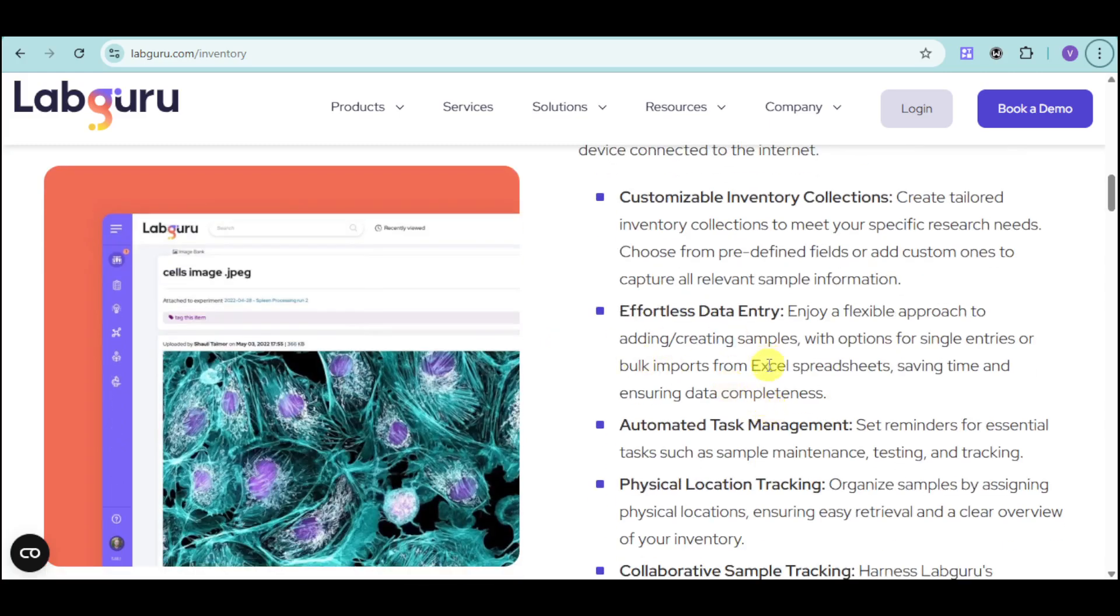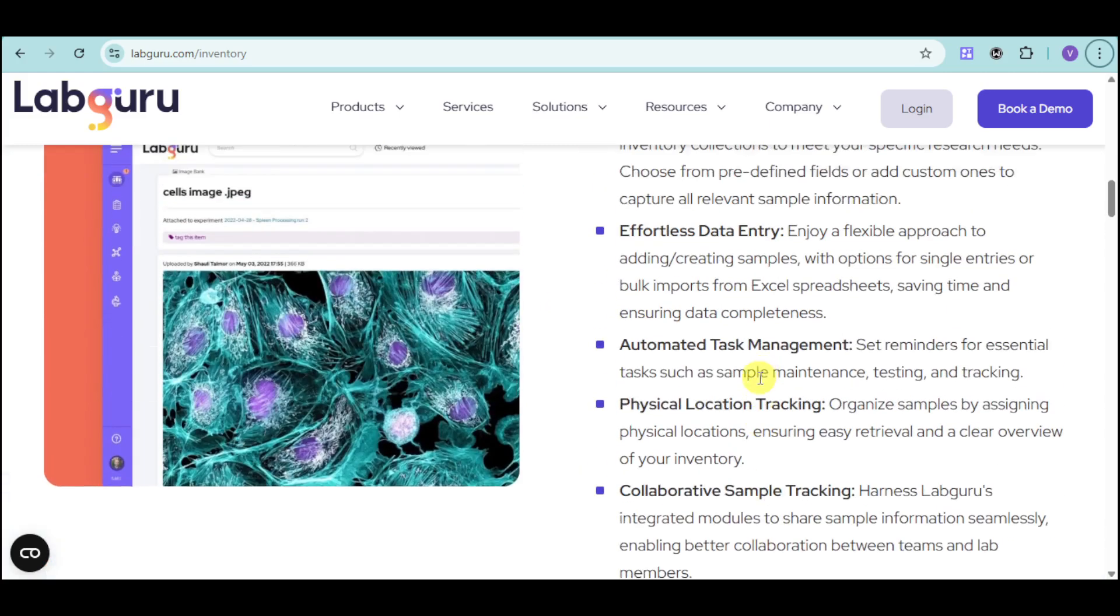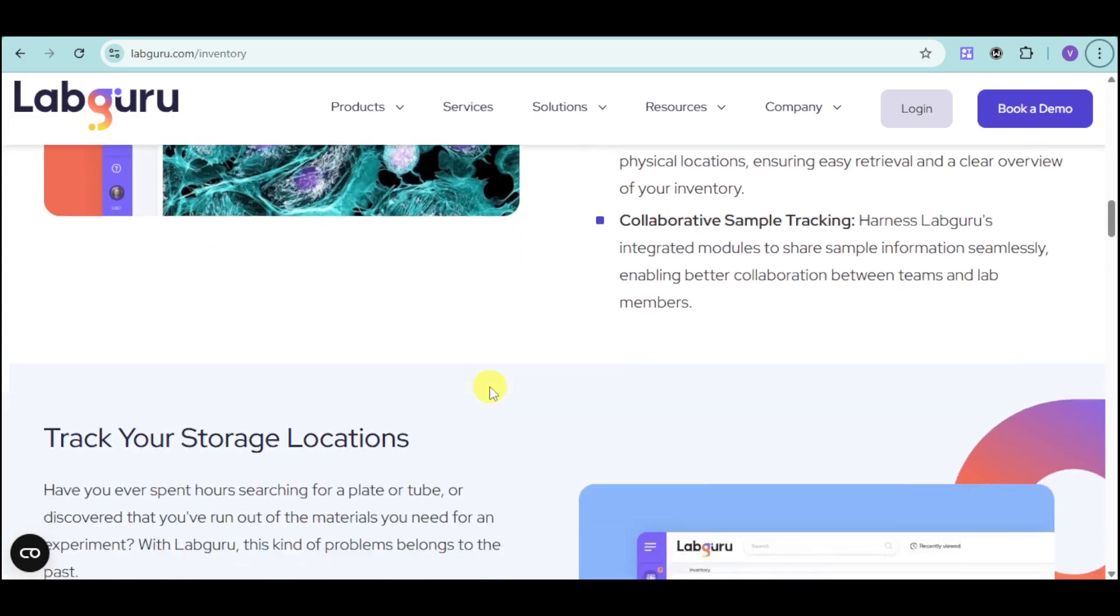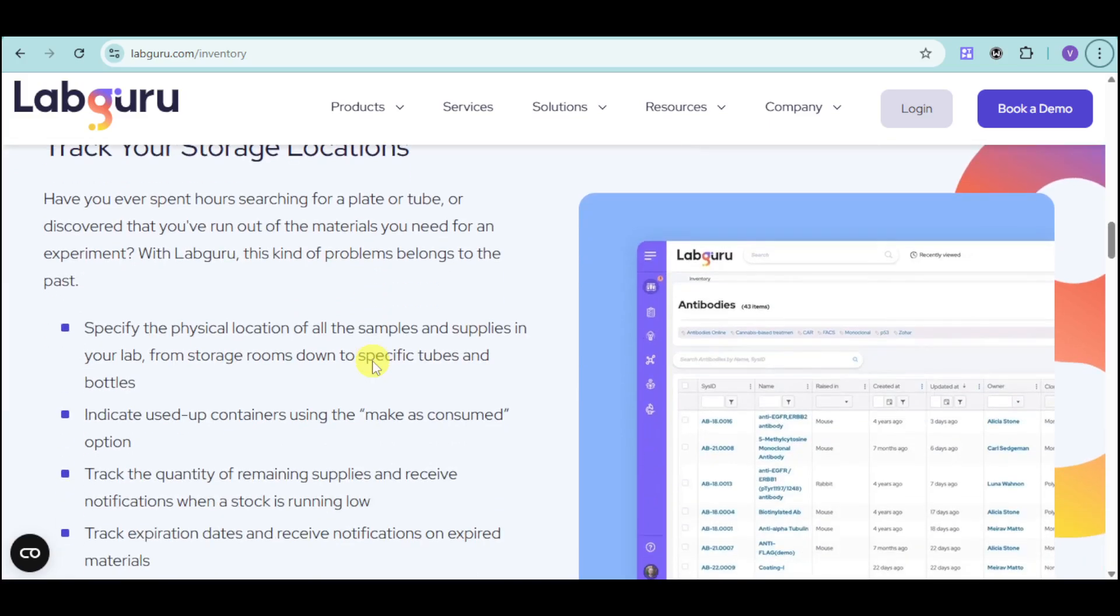You can get customizable inventory collection, effortless data entry, automated task management, and collaborative sample tracking. You can also track your storage locations, specify the physical location, indicate use of containers such as marked as consumed, track the quantity of remaining supplies, and receive notifications when stock is running low.